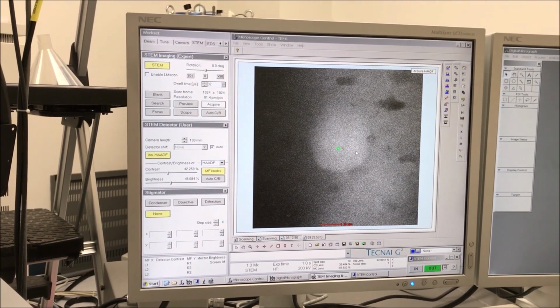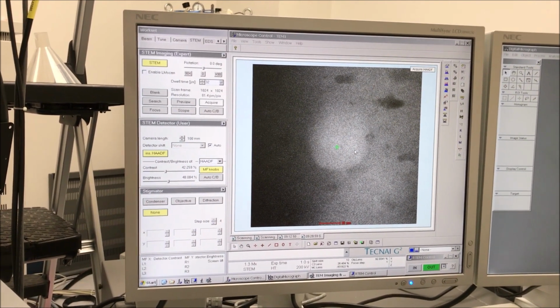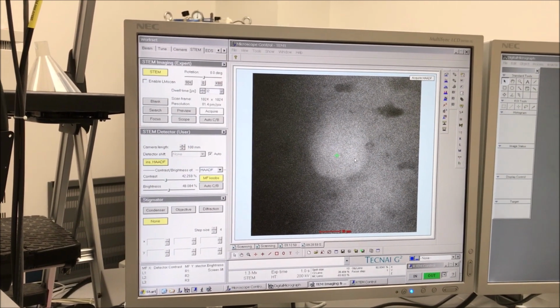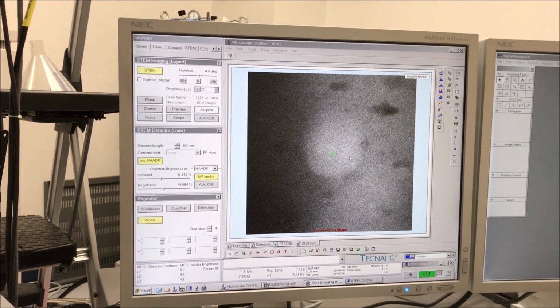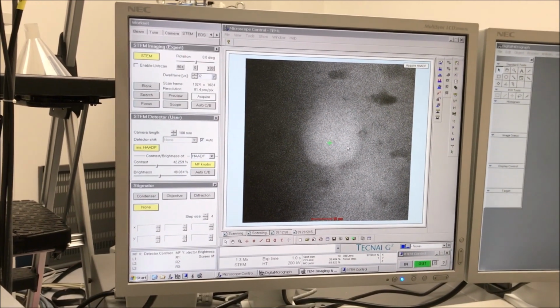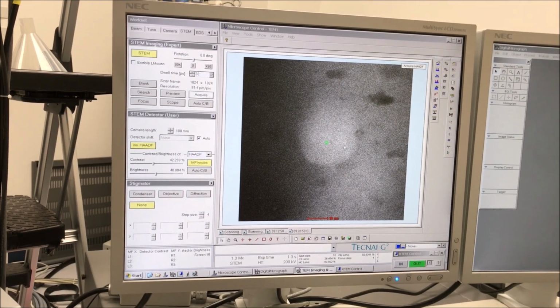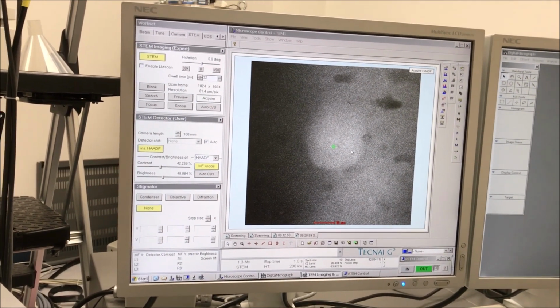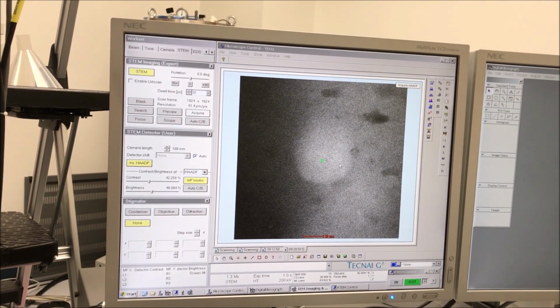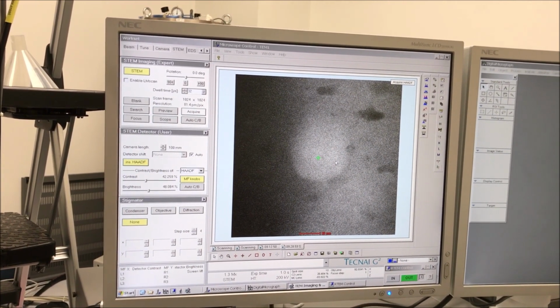So the plasma clean is not this miracle that will completely alleviate any issues. It does work. It works better the newer that the samples are, though. If the sample gets old, it just gets so much stuff on it. It's sort of like if you leave something out in the open, it will collect dust. It's no different with your TEM samples. Even if you store them under vacuum or under controlled conditions, you'll still probably end up with them getting some of this contamination on them.